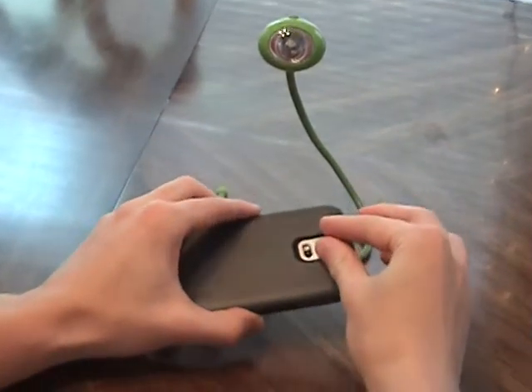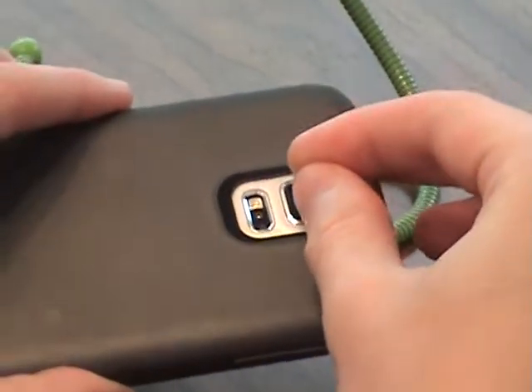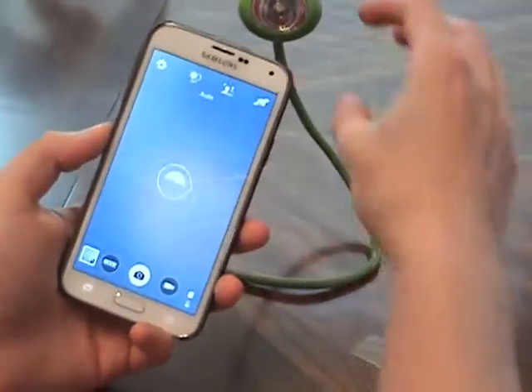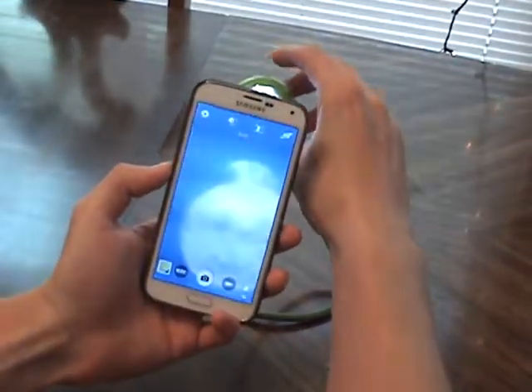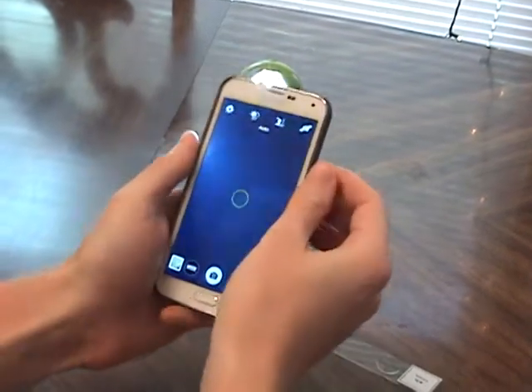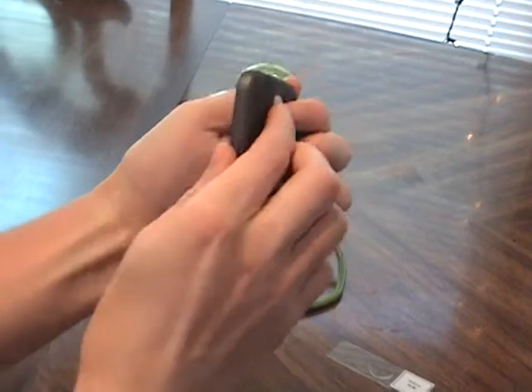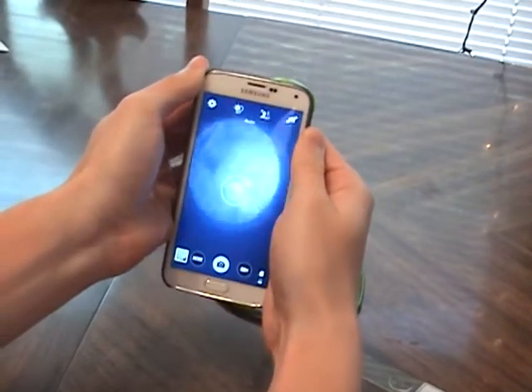So first we take the lens, place it over the camera, and go into camera mode. Turn on the light. So you see it's not quite centered right now. So what we can do is hold the lens sort of like this and move it around to get it centered.